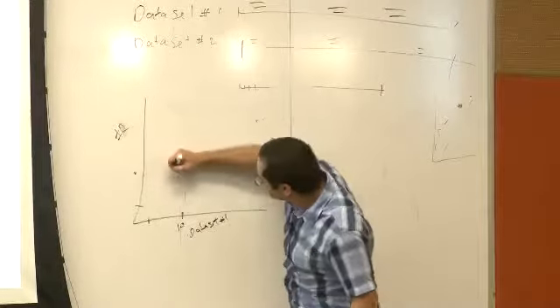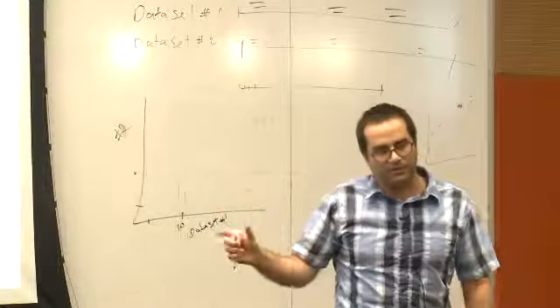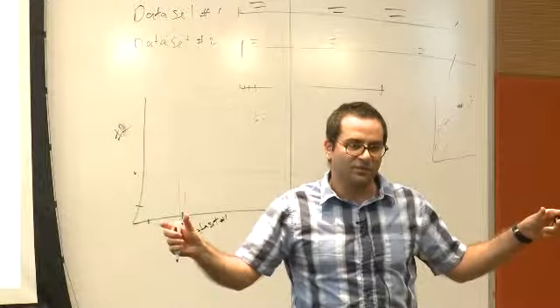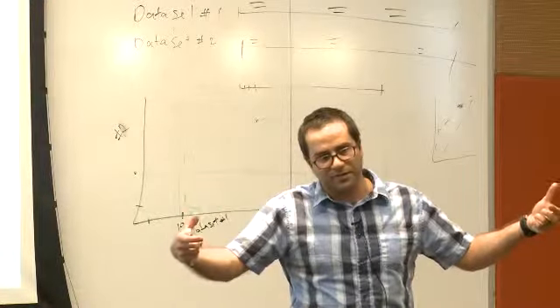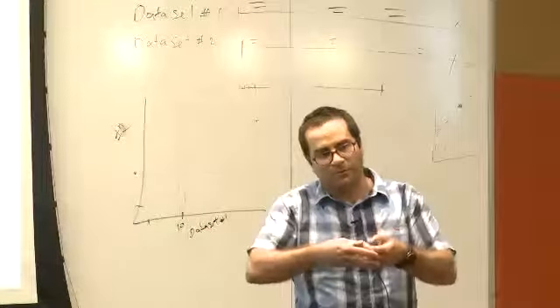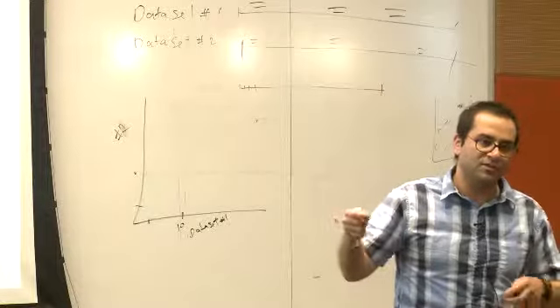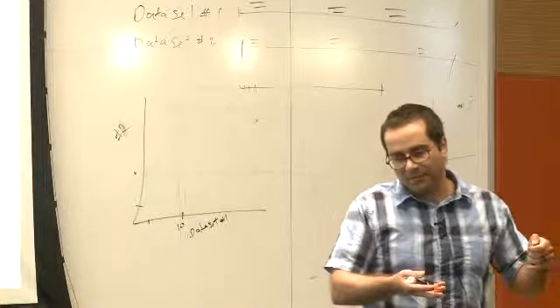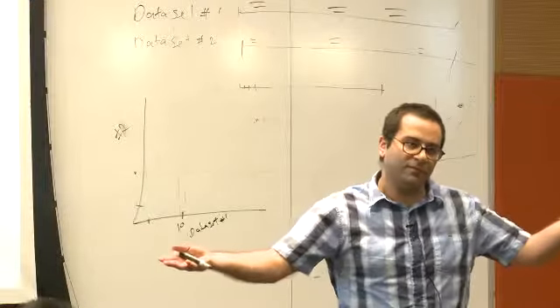But the idea is that this will tell you, when I look at data set number 1 on a specific genomic location, and on data set number 2 on the exact same genomic location, did both of them get a similar number of reads, which tells me if they're comparable or distinct. You do it for each genomic location, and then you can really compare the pattern from the ChIP sequencing in data set number 1 versus data set number 2.